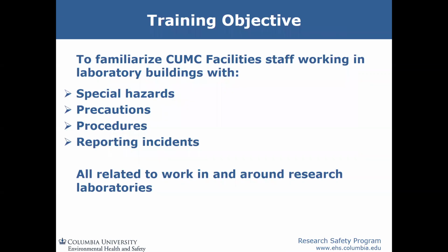Okay, as an overview and objective for today, I hope that all of you will leave here at the end of this talk with familiarity of the following and an understanding of how to identify hazardous materials, precautions to take when working in laboratories, and how to report incidents.